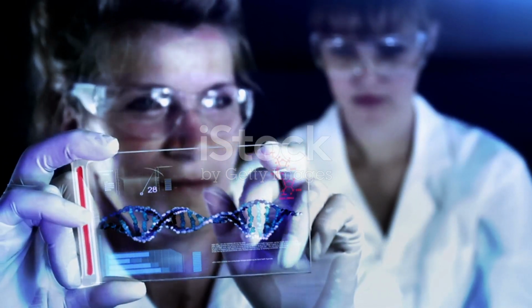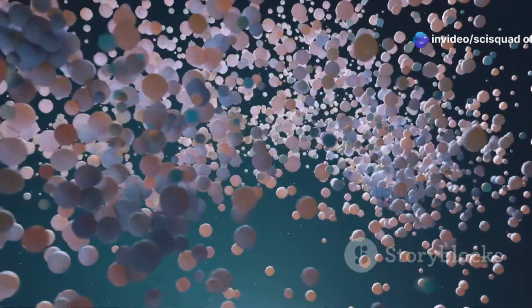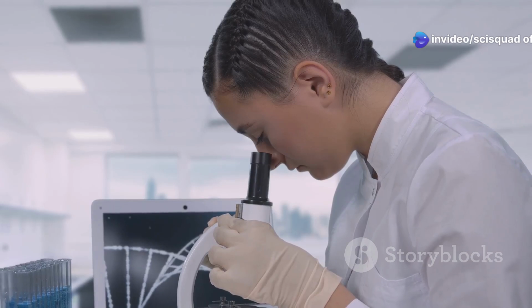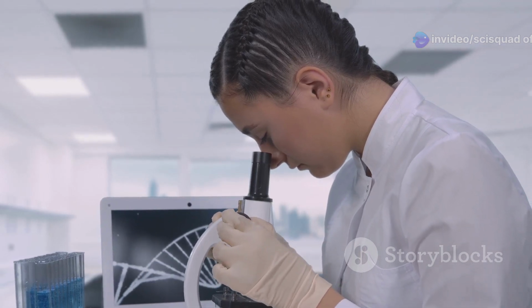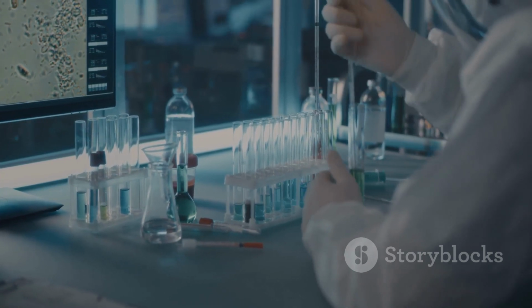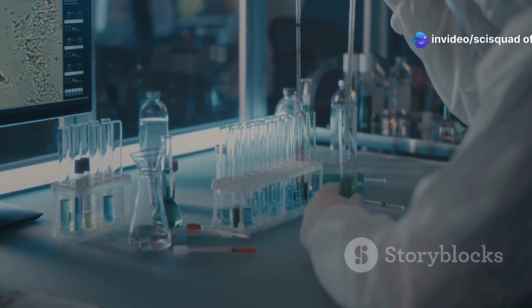So, how does this elegant method actually work? Picture a microscopic construction project where we're trying to replicate a single strand of DNA. We start with a single strand of DNA, the target we want to sequence. This DNA is mixed with a cocktail of ingredients, including nucleotides labeled A, T, C, and G.